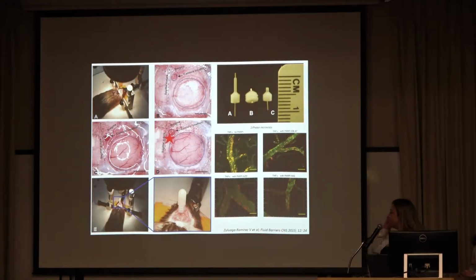And here's another preparation which they called cranula, because of a craniotomy and a cannula together. They had multiple models of cannulas so that they can inject either intracerebroventricularly or inside the parenchyma of the brain, and they can image next to that. The problem is they're not on the same site, so you cannot see what the injection site looks like. If it's an intracerebroventricular injection, of course it doesn't matter where you inject it, but if it's an intraparenchymal injection, you do not see the injection site.